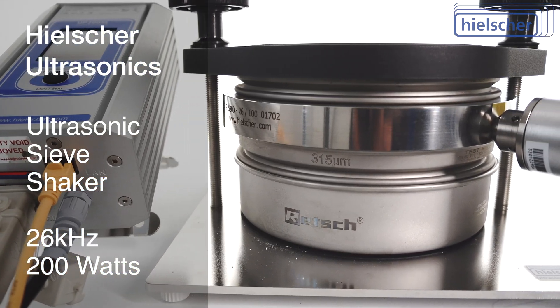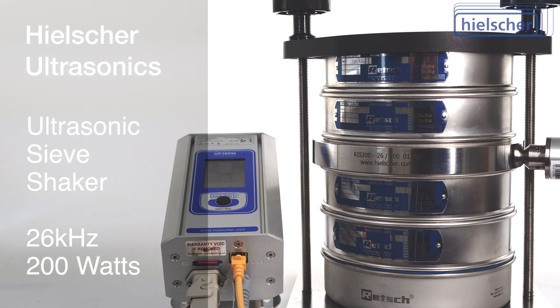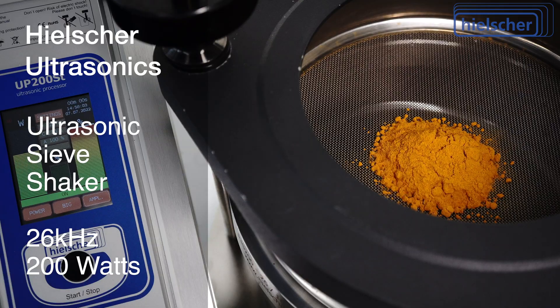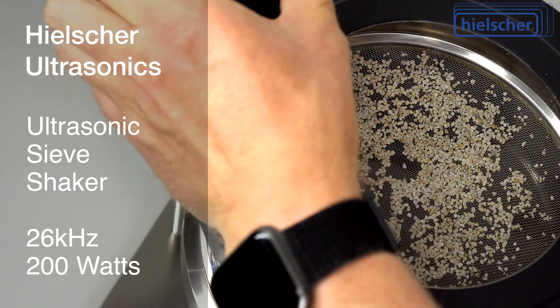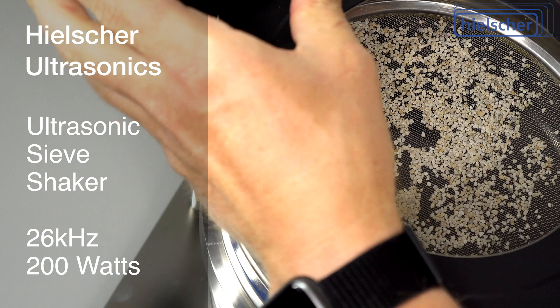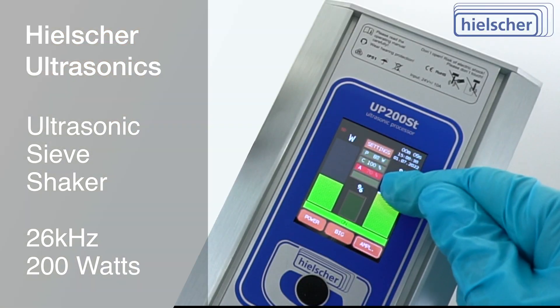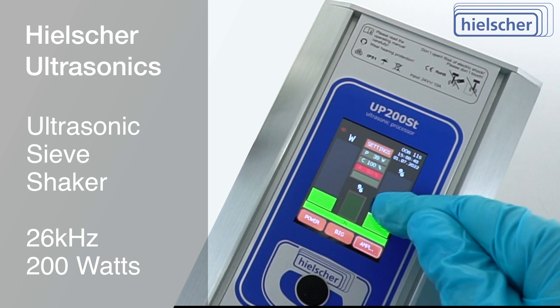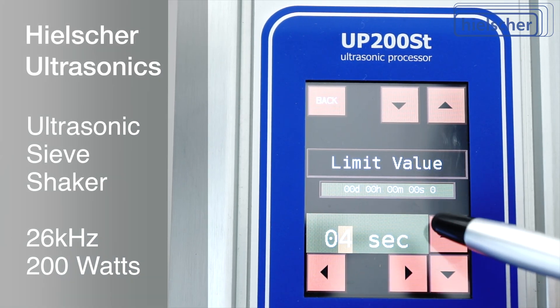Of course, the Hielscher ultrasonic sieve shaker can be operated continuously — for example, to sieve powder coatings, metal powders, or other materials continuously in production, or to separate lumps and agglomerates from powders. The intensity of the ultrasonic vibrations can be easily adjusted on the generator. A timer and a fully adjustable interval mode are, of course, standard.